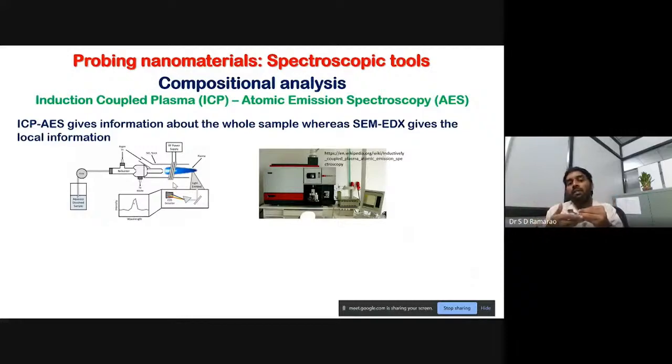It is gaining energy, and as nanoparticles have different atoms, right? The electrons in atoms will be excited to the excited state, and when they come back, they will release energy in the form of wavelength. And you will put some optics here and some processing units to collect the data.